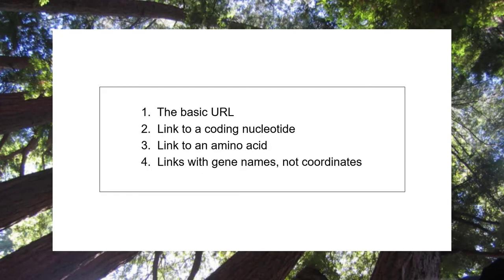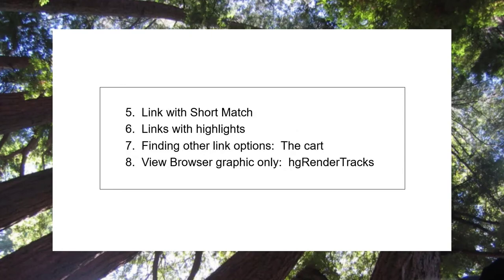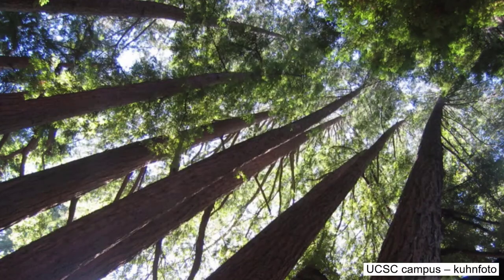In this, the second of the series, we will look at how to navigate to specific locations within genes without knowing their genomic coordinates, how to set highlights, how to find obscure configuration parameters, and how to use some other useful features for making customized links to the browser.